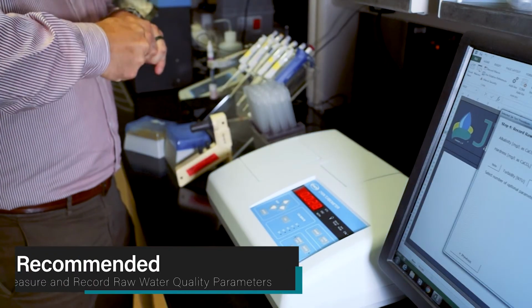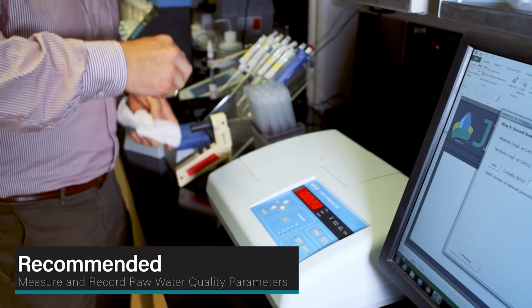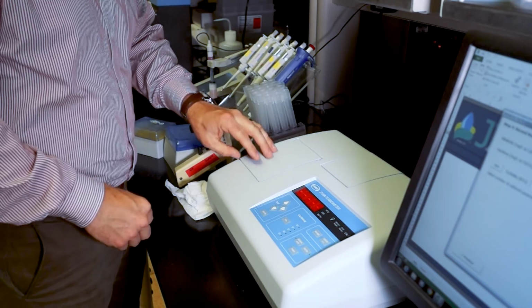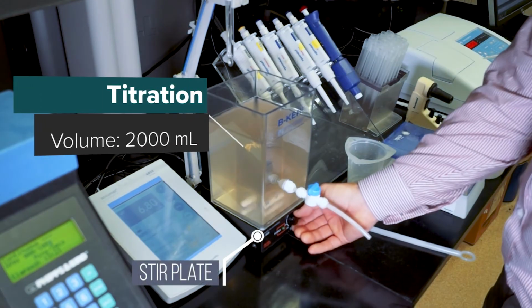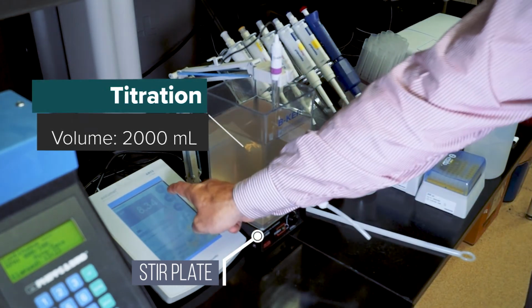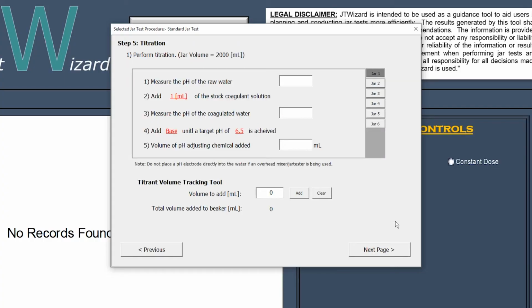We recommend you measure and record raw water turbidity, alkalinity, and hardness prior to each jar test in order to track changing water quality between experiments. Before starting a jar test experiment, we need to perform titrations in order to determine the appropriate amount of acid or base needed to keep the pH constant as the alum dose varies. We will follow the titration steps outlined in the Jar Test Wizard.